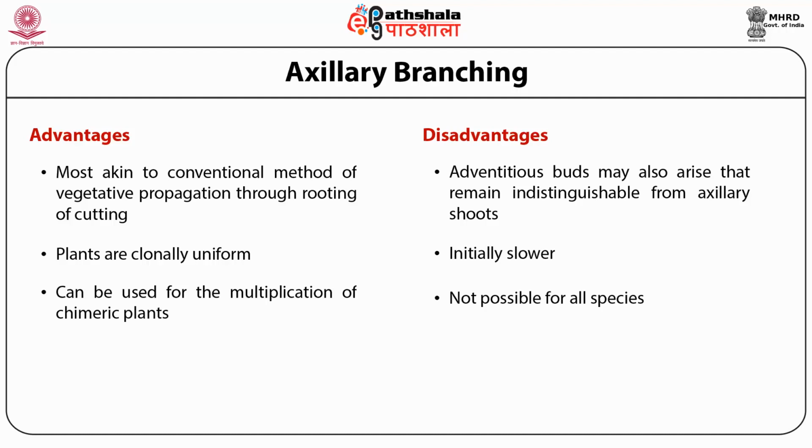It's the safest method when you're dealing with chimeric plants, because here it is not from a single cell but from the bud. And buds have the same genetic makeup as the apical bud, and therefore there is no danger of breaking of chimera.